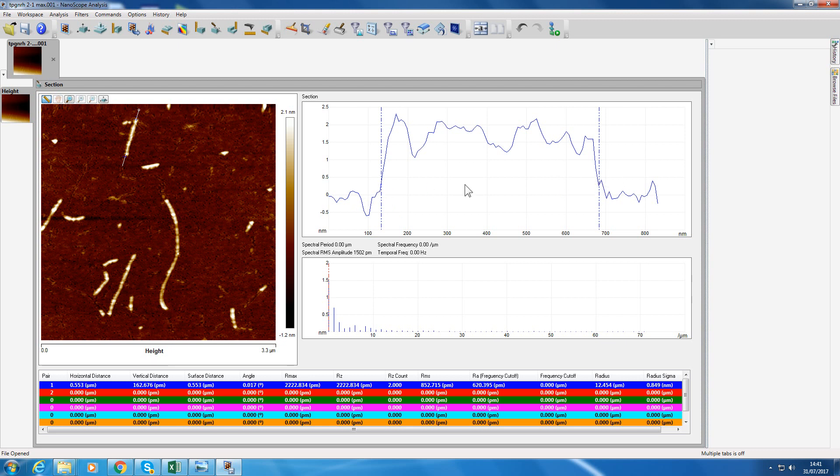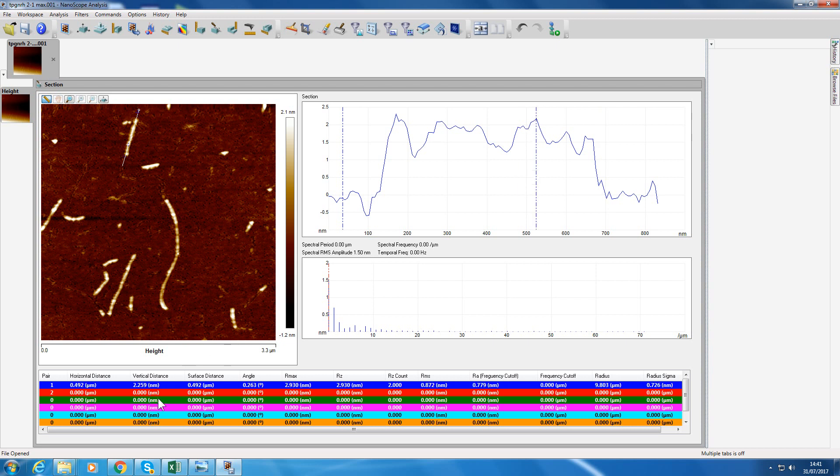The vertical distance here doesn't really mean anything because it's the distance between where that cuts the section there and where this one cut. So that height difference doesn't really mean anything, but you could make it useful. If I put that on the baseline and put another one maybe on one of the higher regions, now I can read off the vertical distance as 2.259 nanometers. So that would be the height of the material.